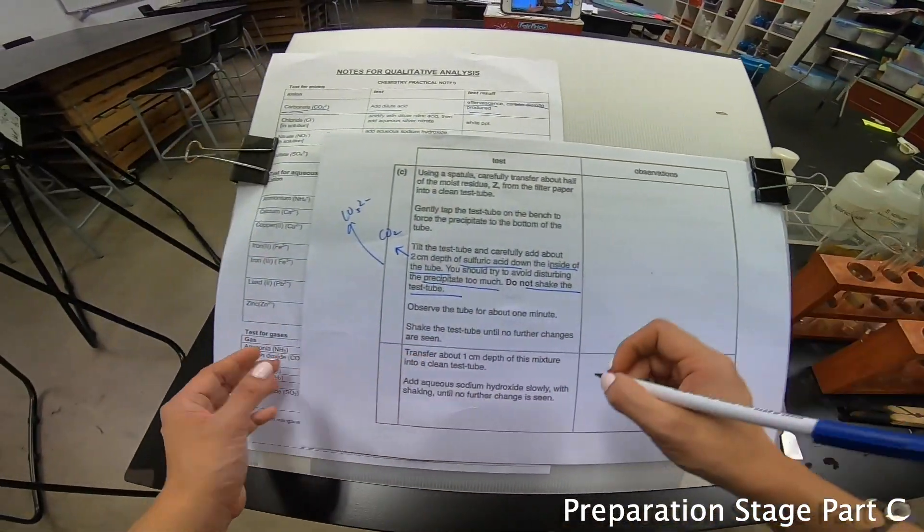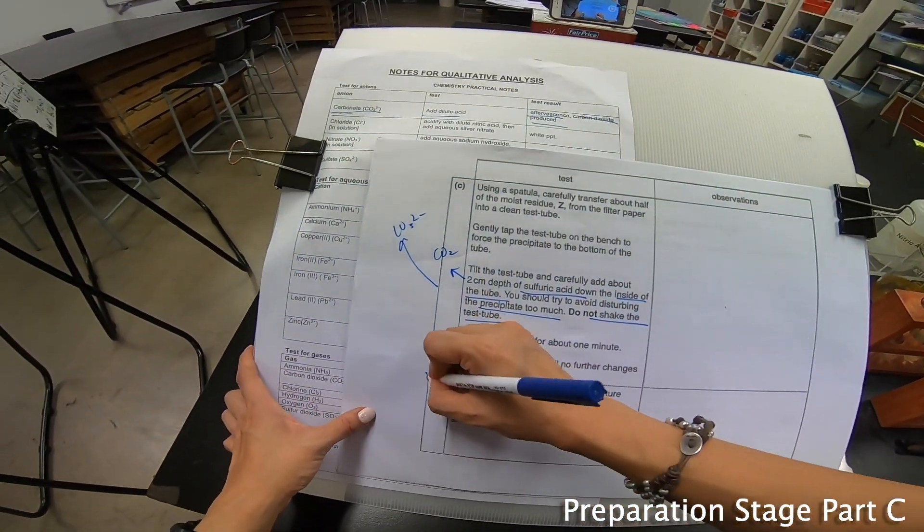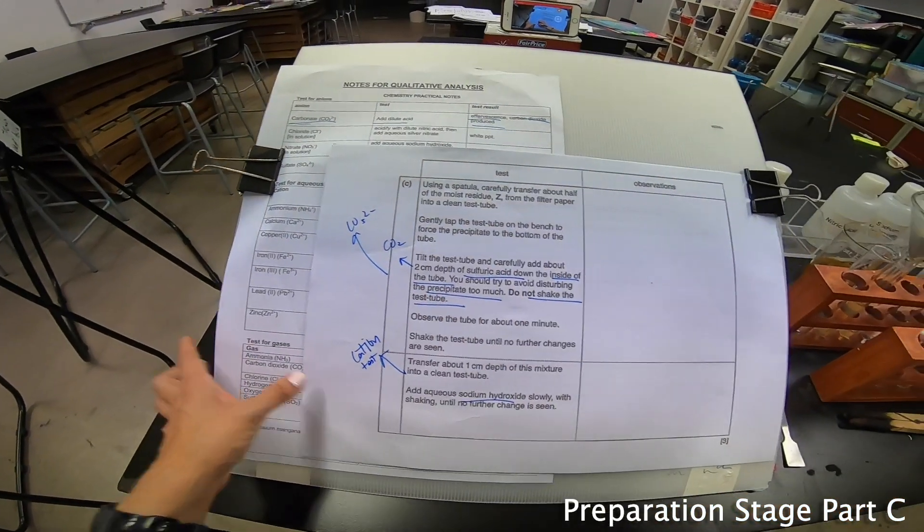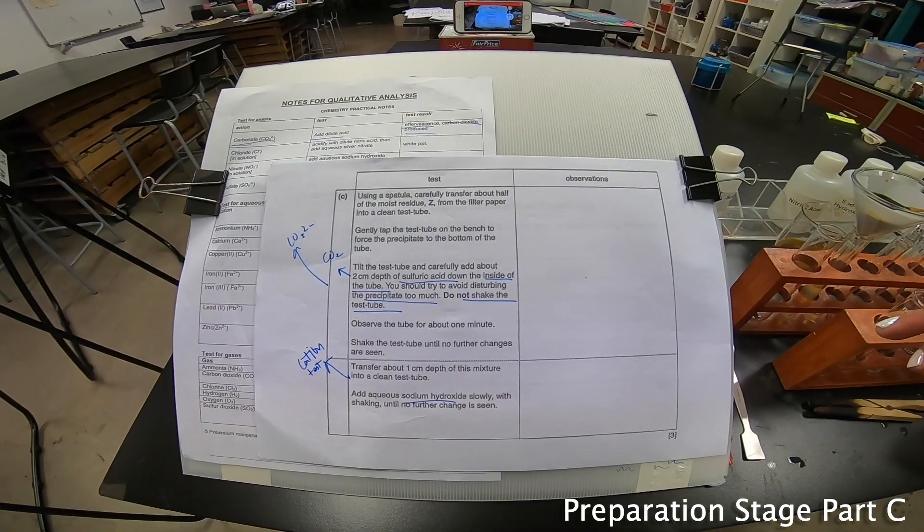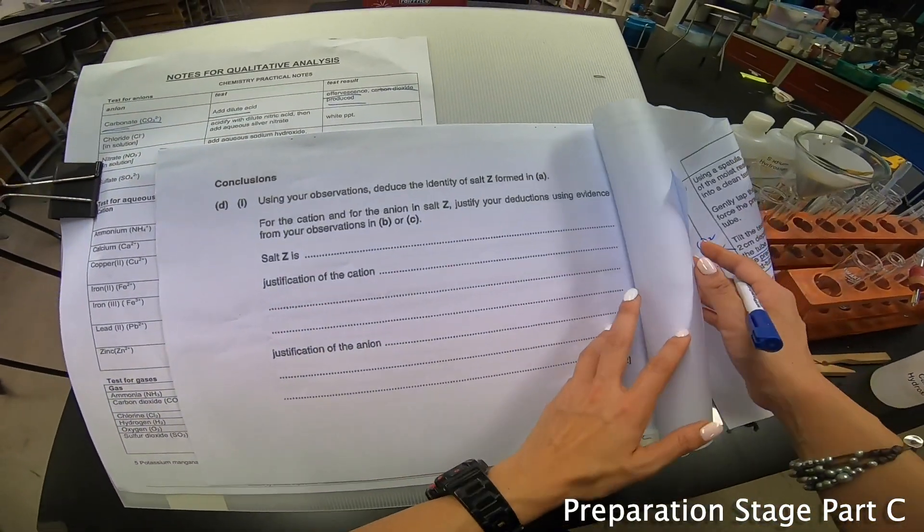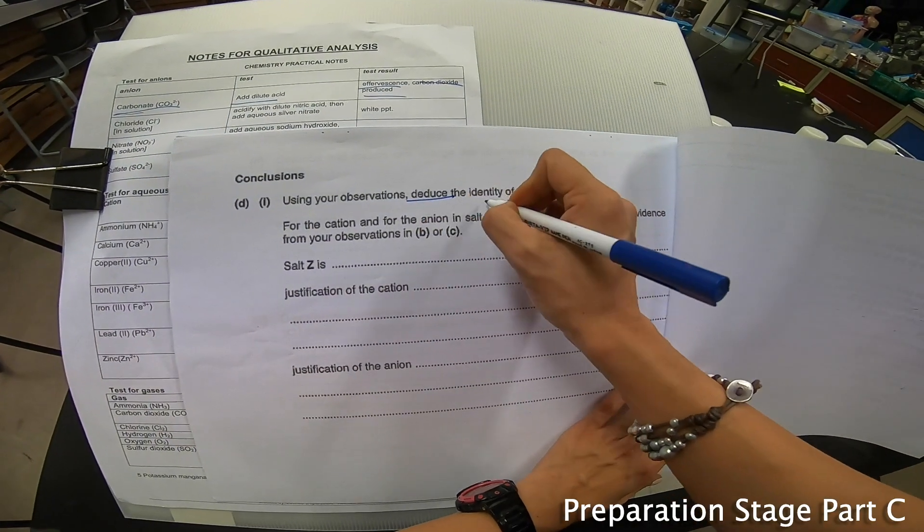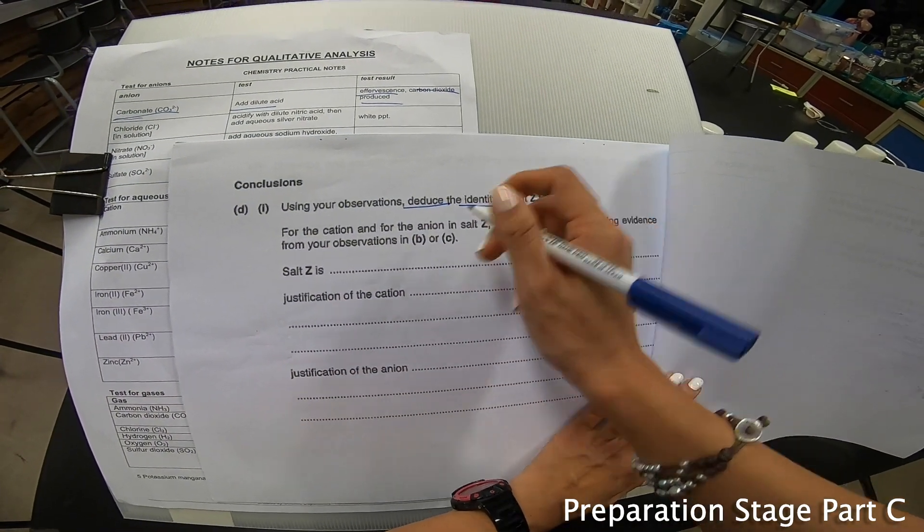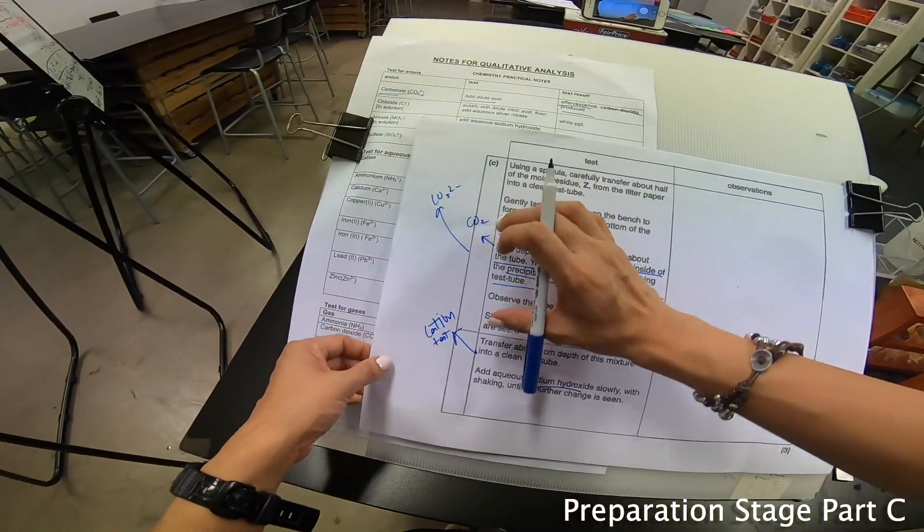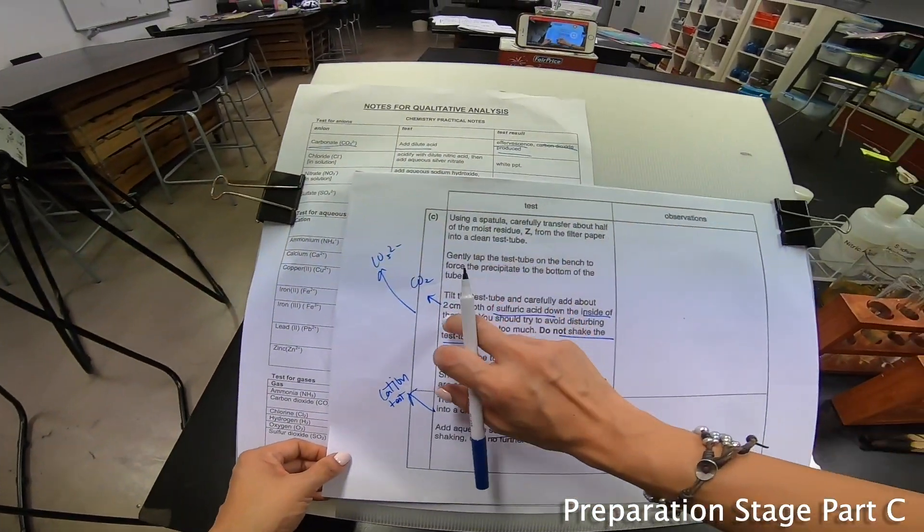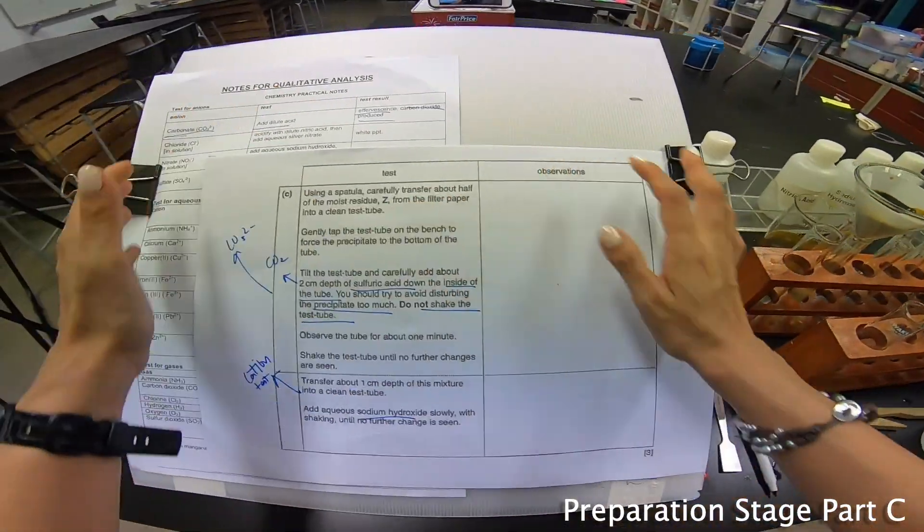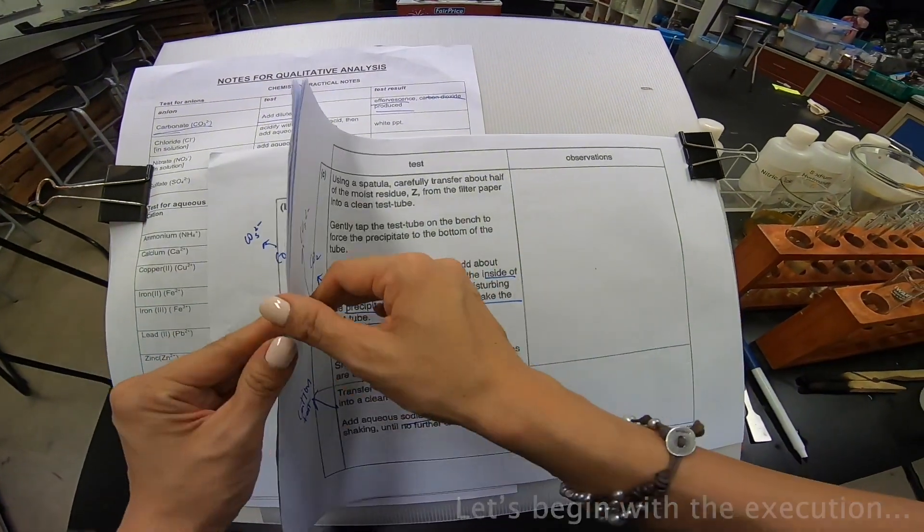Now I noticed that they add sodium hydroxide. This is actually a cation test. I'm going to leave it as it is now. Let's take a look at the back at what you're looking for. True enough, you're trying to deduce the identity of Z and you have to know the cation and the anion. So let's start since we have already prepared everything. Let's start the execution.